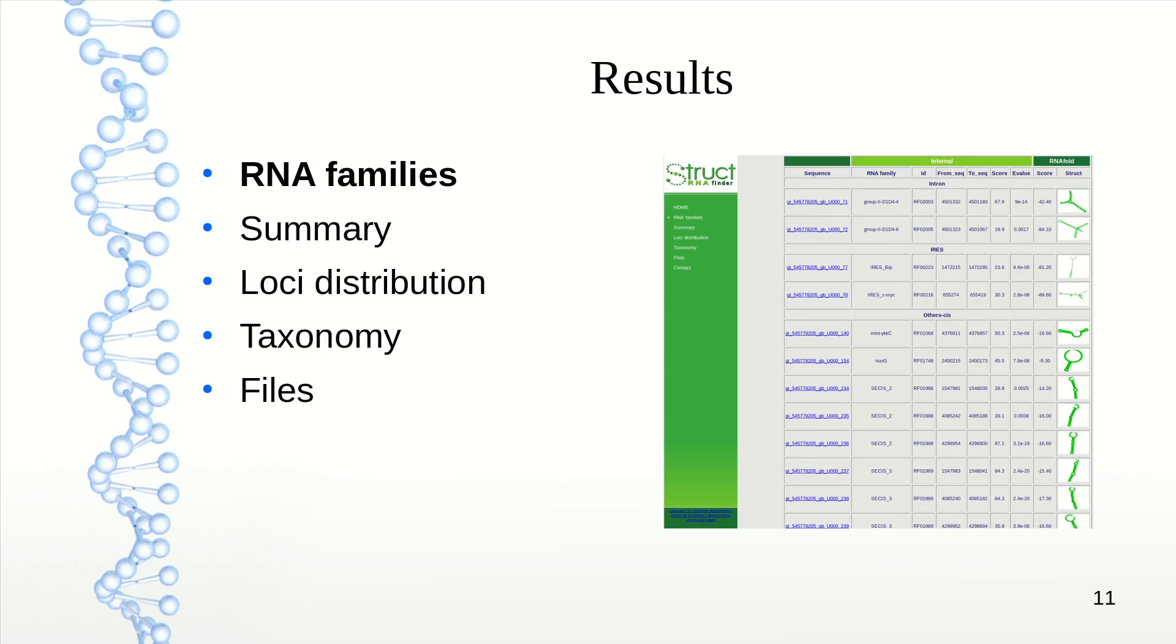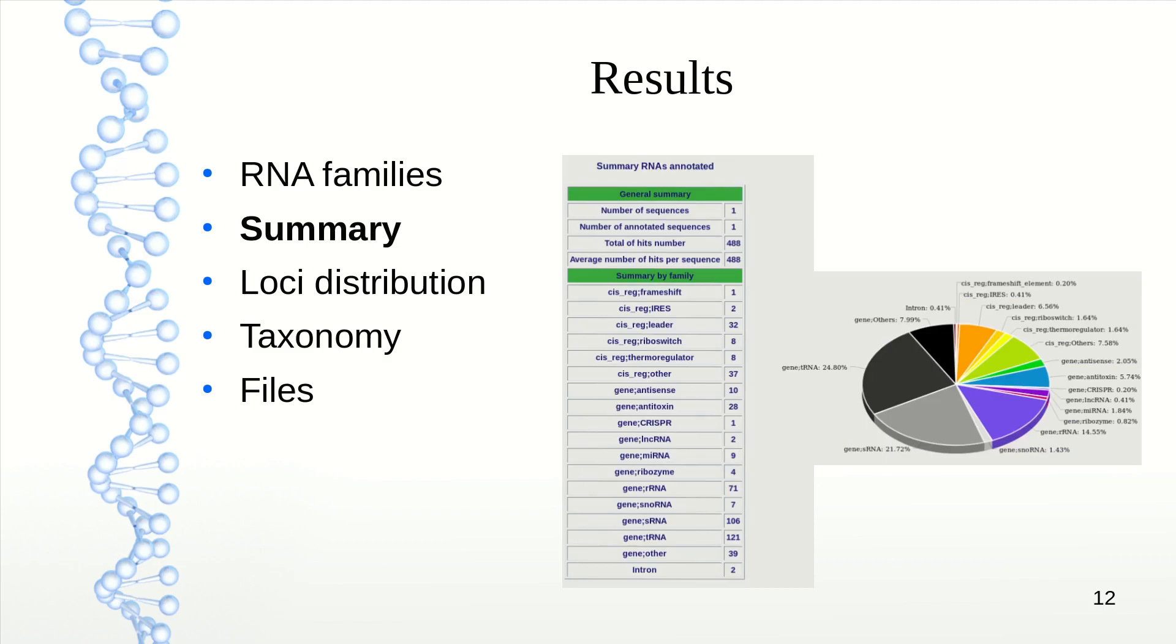In the summary of results, we can see we provided one sequence with 488 hits, and which family the RNAs belong to. On the right side is a pie chart, automatically made, showing how much each family is represented in the results.